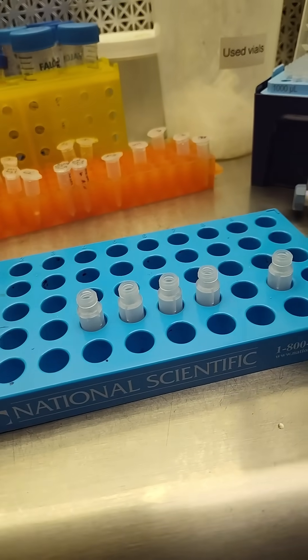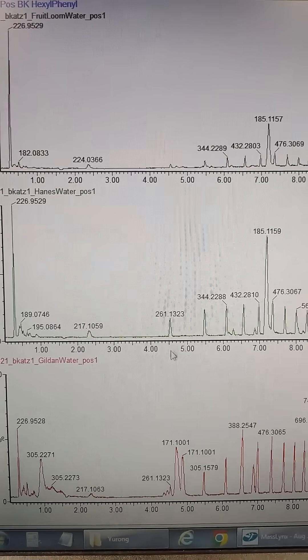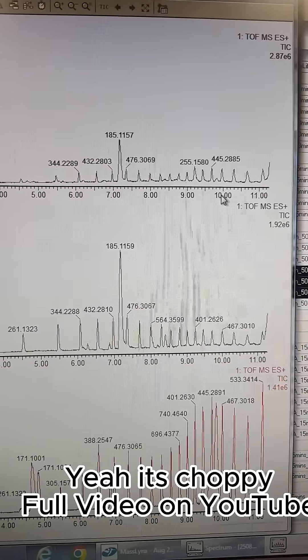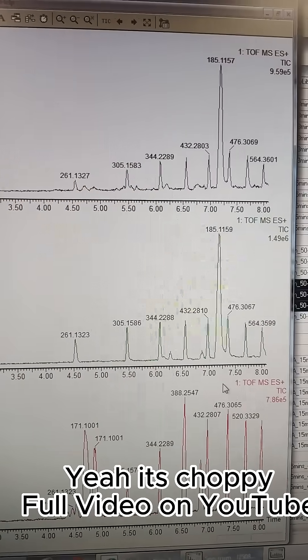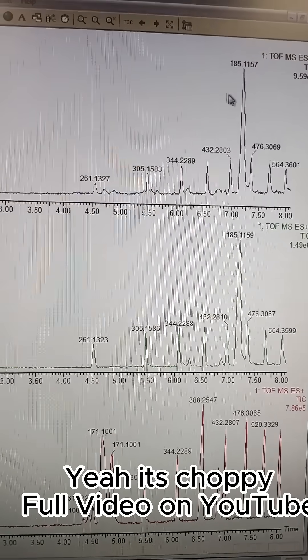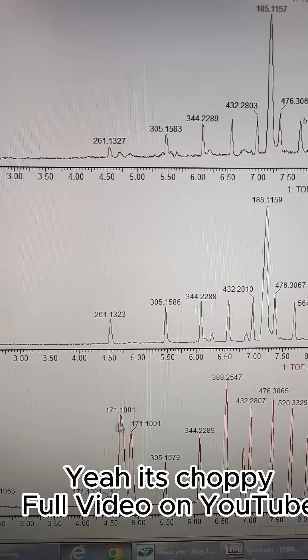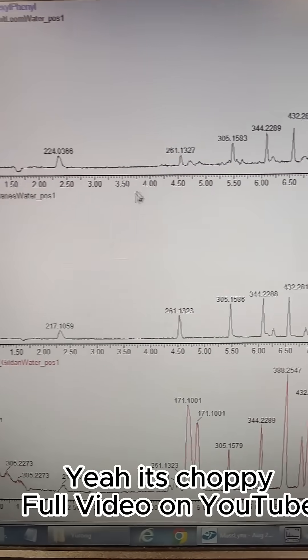We're doing a five microliter injection comparing just the inexpensive shirts from Amazon. You can see that we have a difference in signal in this early region. The Gildan does have some of the lowest numbers and it doesn't include this 185 mass, but it does seem to have a 171 mass that the other two don't have, so it's slightly different.